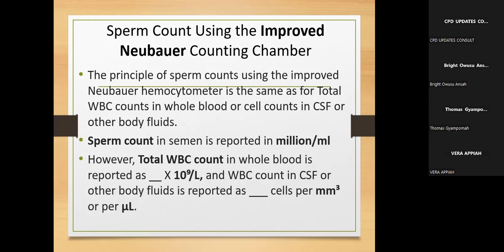All right. However, for the semen or sperms, you are going to report in million per mil. All right. So this is the differentiation that I wanted to bring to your attention.